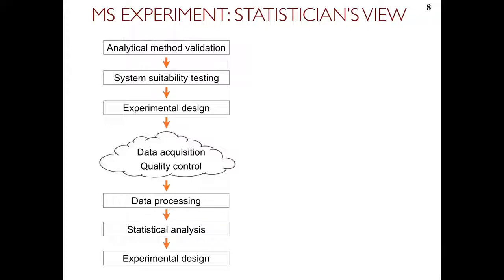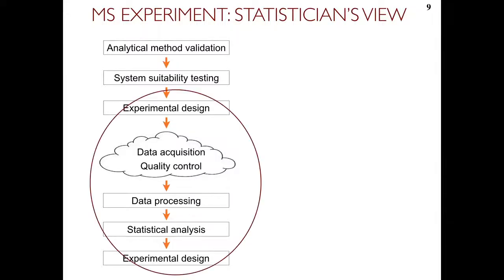And so now let me just show you the outline of the data analysis workflow and how statisticians would see that. You probably have seen presentations by experimental scientists where they will talk in great detail about data acquisition and instruments and sample prep, and then they will have a little box, bioinformatics, right? So I'm kind of doing this the opposite, right? I have this little cloud saying wet lab, right? The point is that there's quite a lot of statistics that has to happen before we get to the point where we collect the data, and also after we collect the data, right?